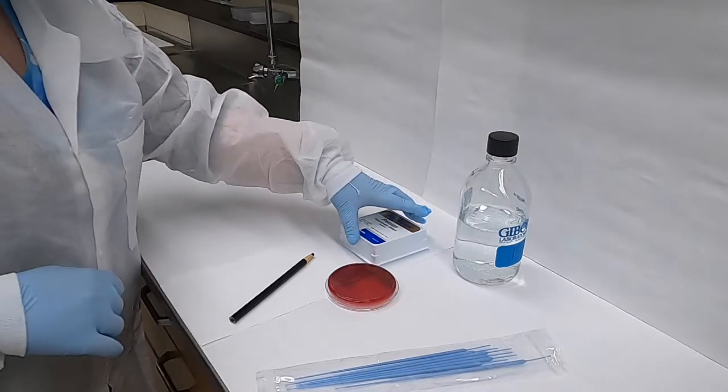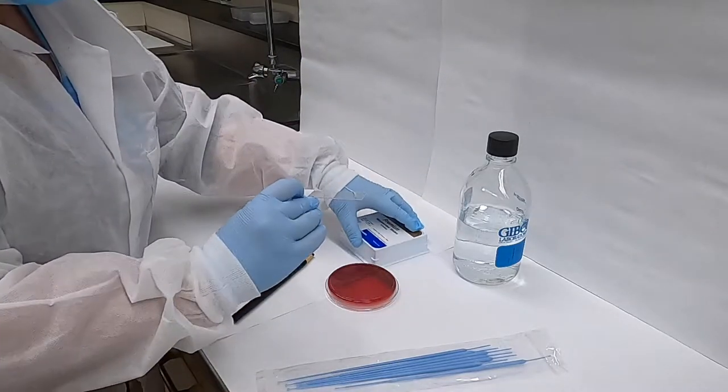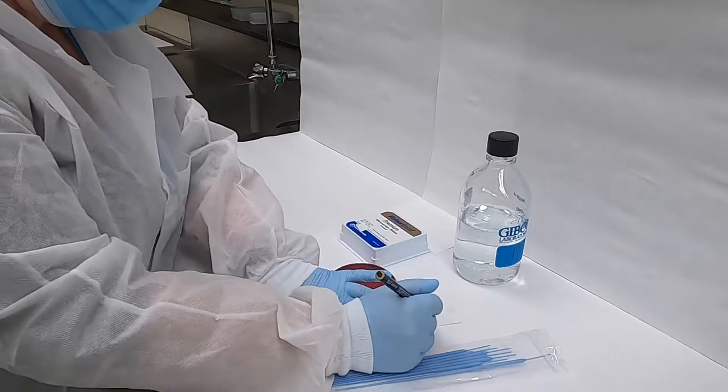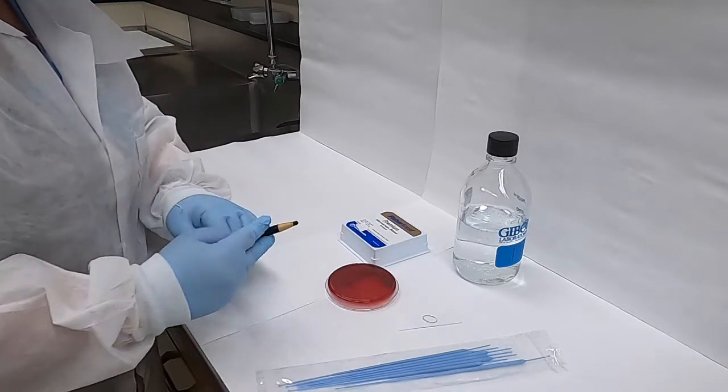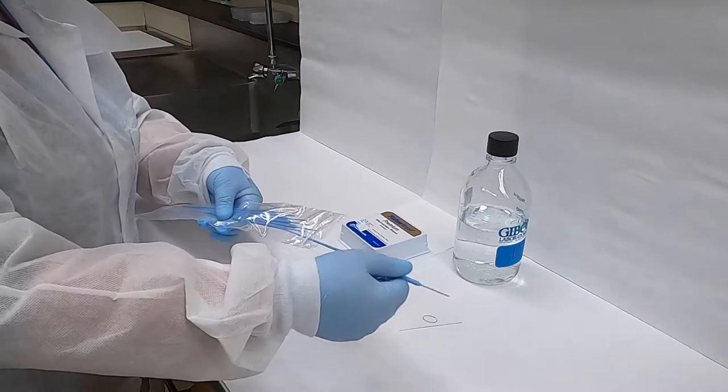The first step of the procedure is to prepare our glass slide. Remember to place your slide frosted side up. We're next going to draw a circle on the slide using a grease pencil which will help us to contain the materials that we're staining and also to orient yourself when visualizing under a microscope.